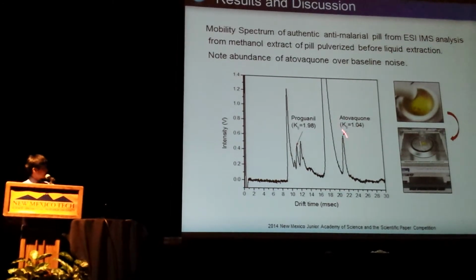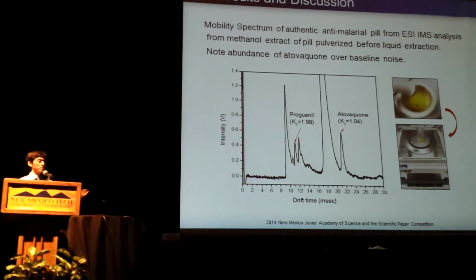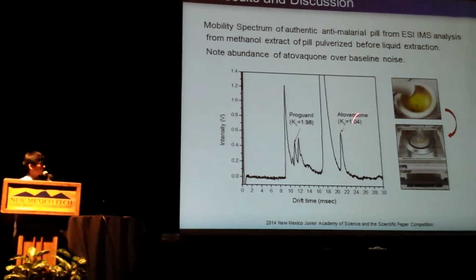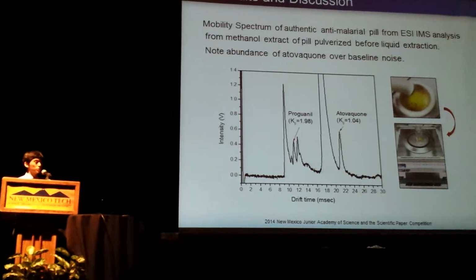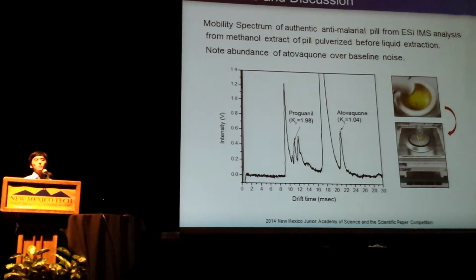You can see that the graph now has much more distinguished peaks. This is what I used for the different concentrations, as I changed the concentrations of the vials to simulate fake medicine by diluting it.